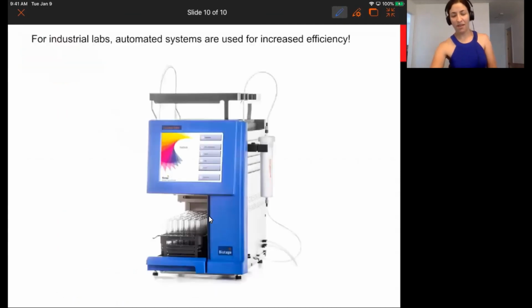The way that you're going to look at your fractions is you're going to obtain a new TLC plate, and you're going to spot a little bit of solution, 1, 2, 3, etc., into each lane of a TLC plate and develop it. Once both of your molecules have been observed on the TLC plate, you know that you have eluted them from the column, and you can assess how well you achieved the separation of them based on how many spots are observed in each individual fraction. So that's going to be today's experiment.